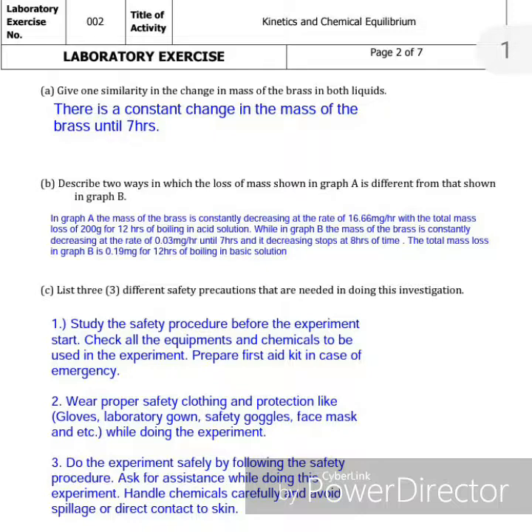Number 2. Wear proper and safety clothing and protection like gloves, laboratory gown, face mask, goggles, etc. while doing this exercise. Number 3. Do the experiment safely by following the safety procedure. Also ask for assistance while doing this experiment. Handle chemicals carefully and avoid spillage or direct contact to skin.